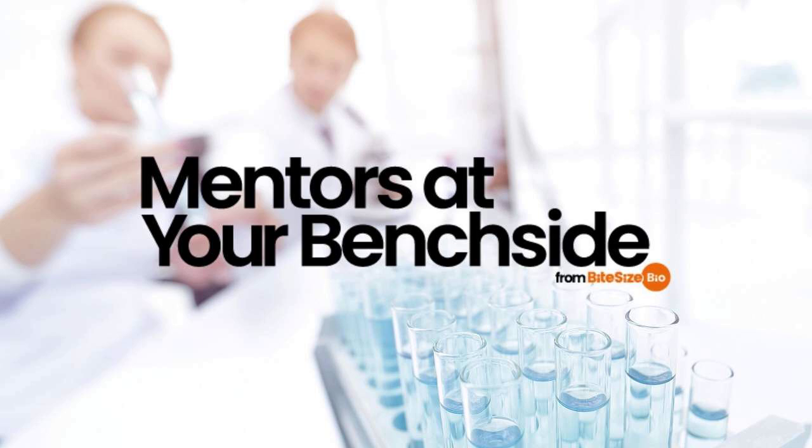So what are your choices if you want or need to fix your samples? There are two commonly used classes of fixative: alcohols and aldehydes. Alcohols, usually ethanol or methanol, are precipitating or denaturing fixatives that coagulate proteins. They will dissolve lipids, meaning that they create large holes in the cellular membranes, including plasma membranes and nuclear membranes. Alcohols are generally good when you're interested in DNA analysis. Coagulation of the proteins around DNA allows even access to the dye, leading to a good coefficient of variation.